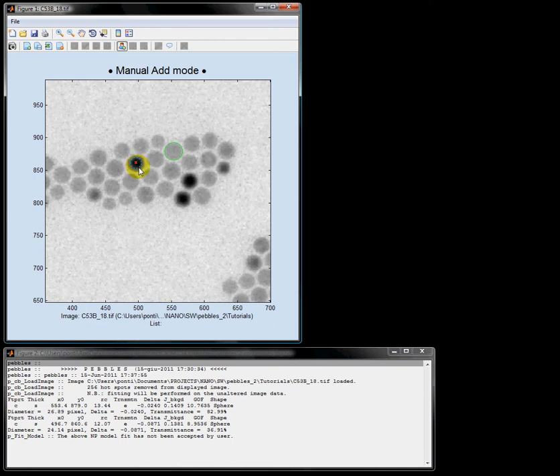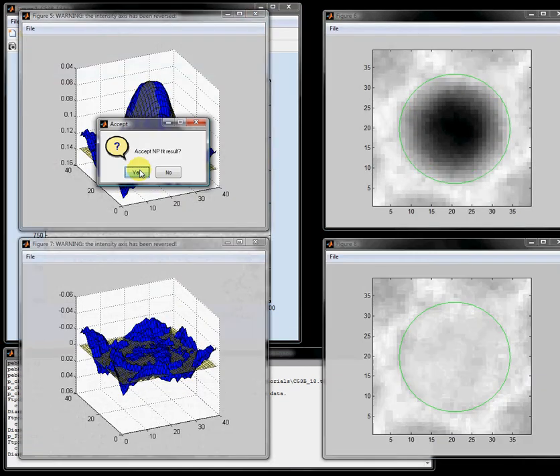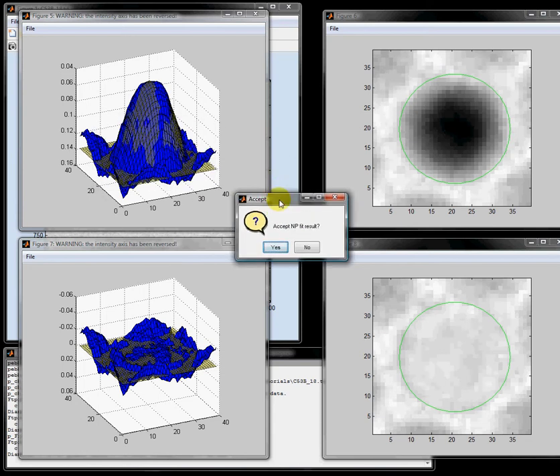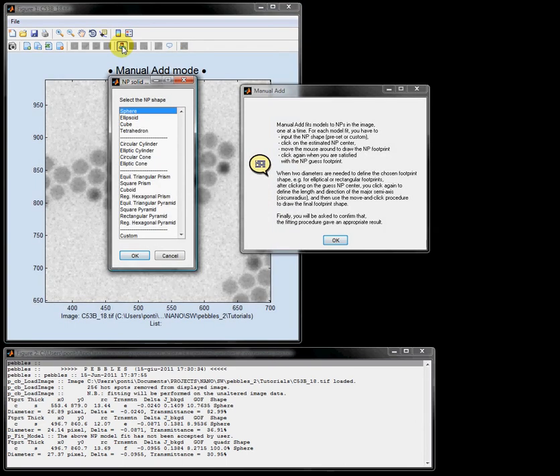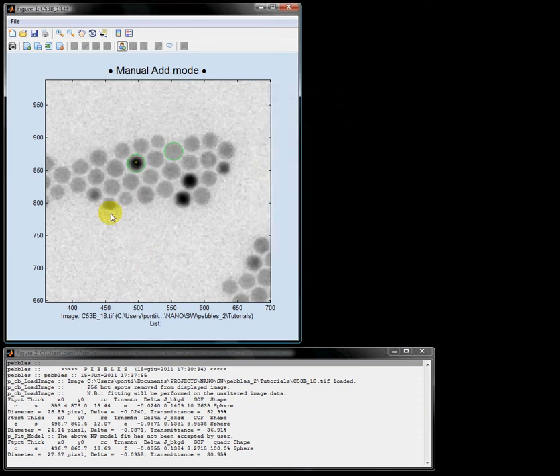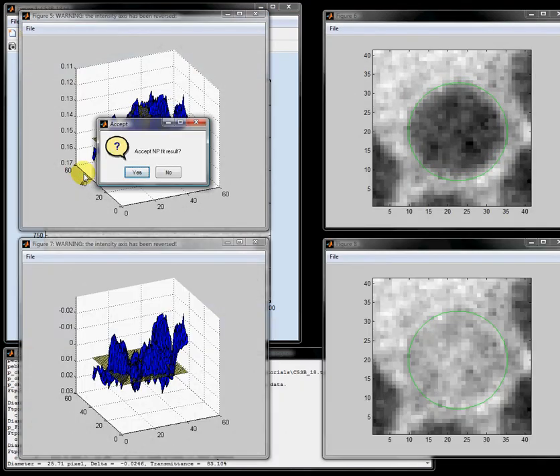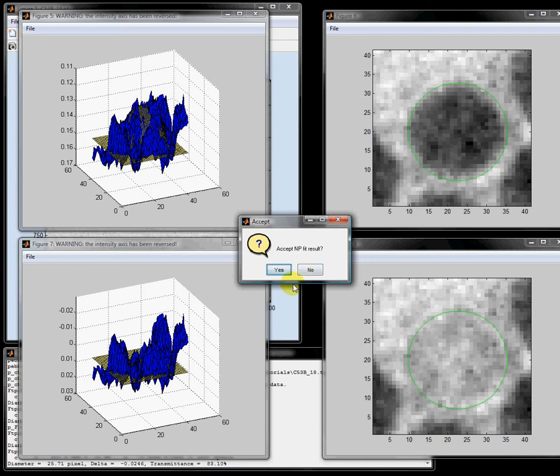I click on the center, drag, and click again. Now the surface is better fitted to the model and also the nanoparticle edge looks good, so I accept this result. Let's do it one last time: press the manual add button, select the nanoparticle shape and the intensity model, click on the center, drag the mouse, click again to start the fitting, and finally validate or reject the result. In this case that's good — yes.